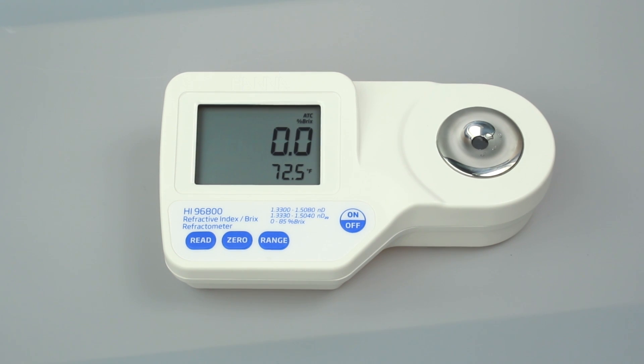After calibration, the refractometer is ready for measurements. To take measurements, simply add sample and press read, taking care to cover the prism if there is strong light.